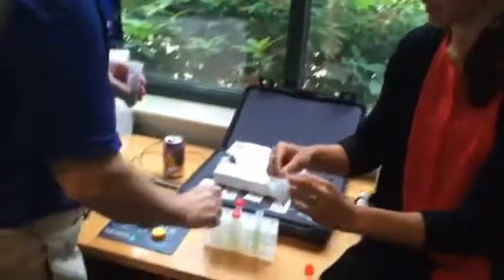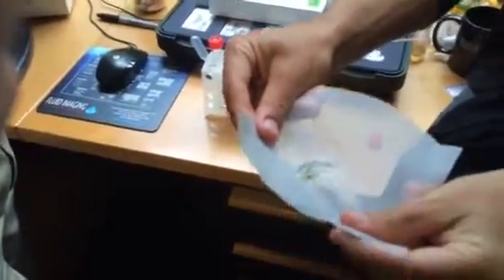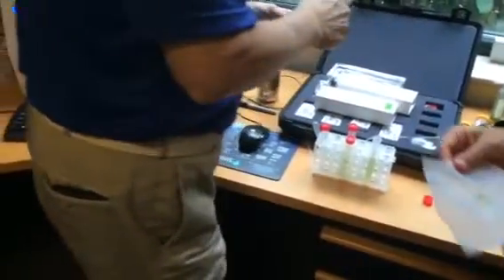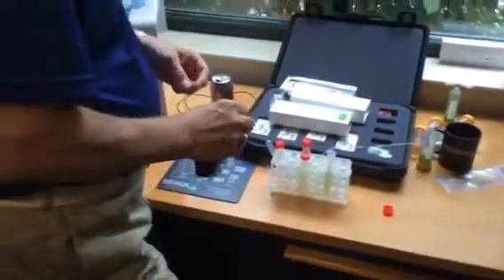As you can see, the 100 micron mesh did its job. It sure did. And you can actually just rinse these and reuse them most of the time. Oh, good. Cool.